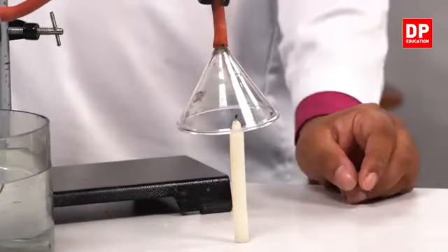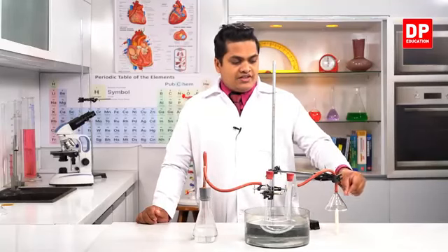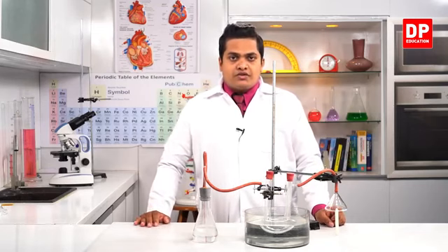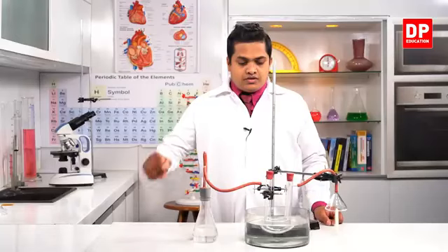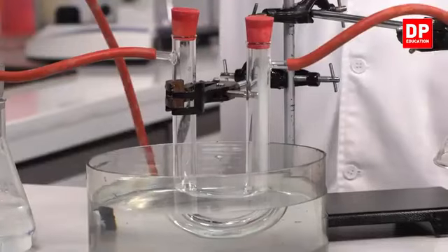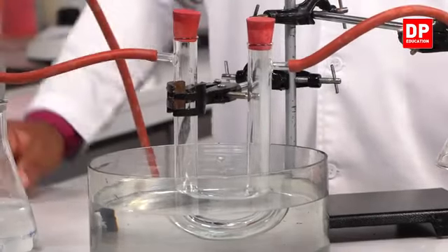The delivery tube allows the gas or product coming from the candle to flow. Then here you can observe a U-shaped tube. It has been drawn into the shape of a U.